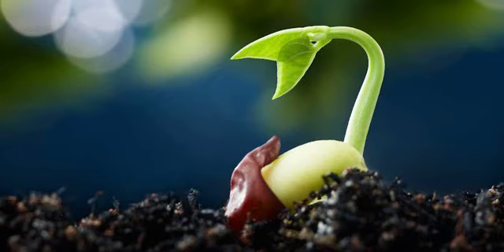Miscellaneous items, glassware, and chemicals required. Germination paper and sand are the basic supplies required for the germination test. Some glassware, such as petri dishes, beakers, funnel, measuring cylinder, muslin cloths, rubber band, and tube, etc., and certain chemicals like potassium nitrate, thiourea, gibberellic acid, and tetrazolium chloride are required for specific purposes.